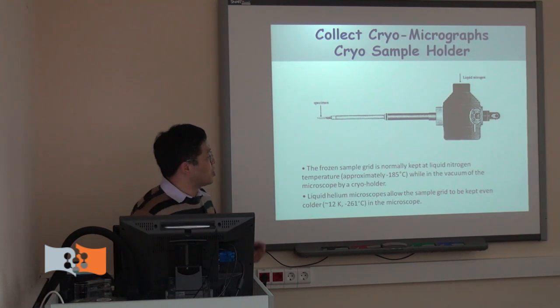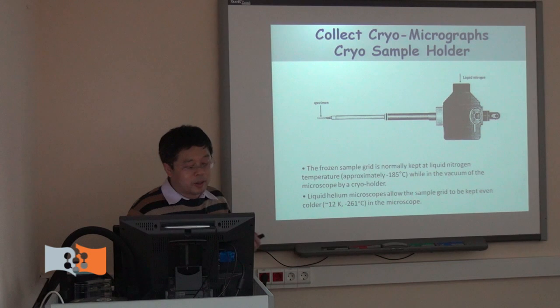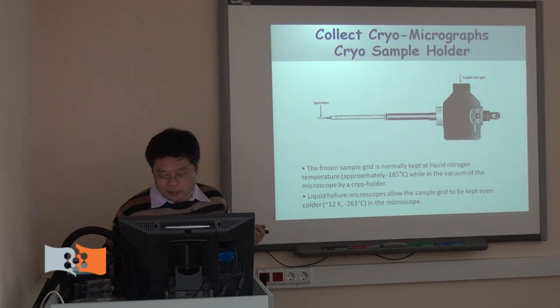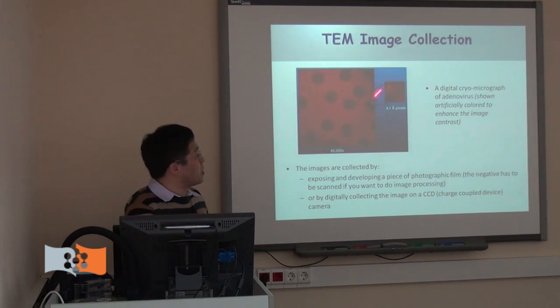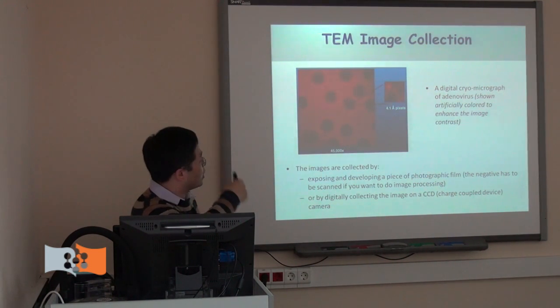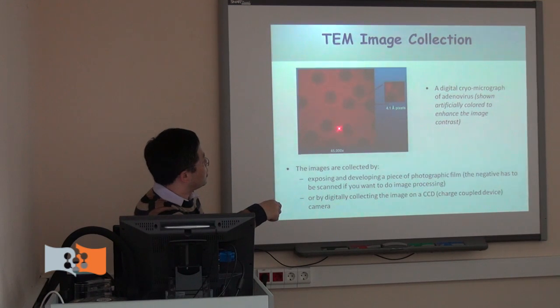But in the newly designed electron microscope, we don't even need this. We can use other devices, and you can send up to 12 EM grids at one time into the scope. So it's much more convenient now. After we insert the sample in the electron microscope, we get the EM image. We collect the data. This is a pseudo-colored EM image, a typical image of the virus sample.